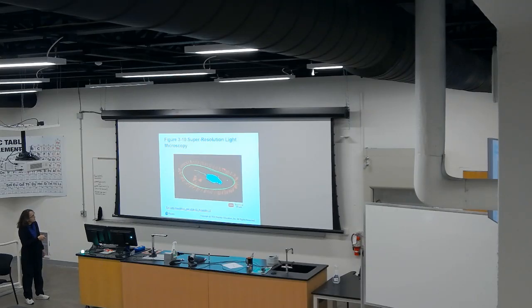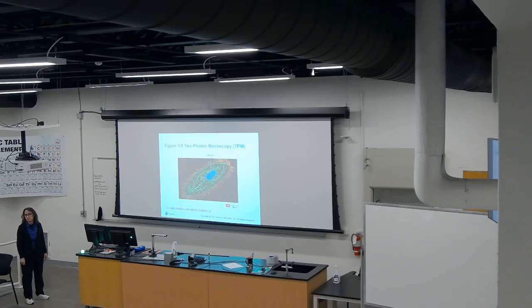But you can see really great definition in the pili or the flagella. And something that you can see within this paramecium is the initial part of the plasma membrane. And what you can see here are the channels that this plasma membrane has, which you couldn't see before with this two-photon microscopy.